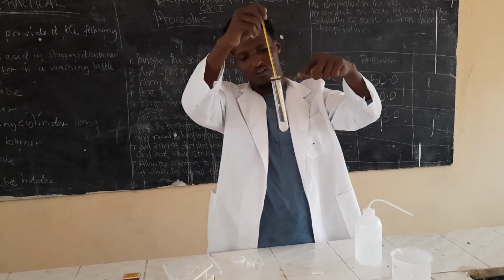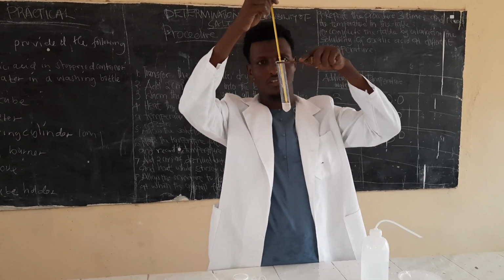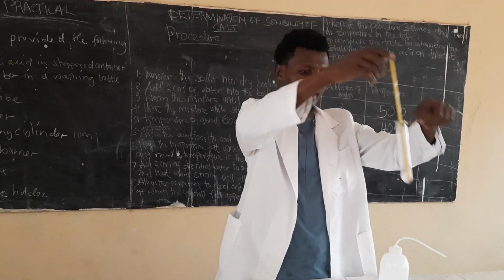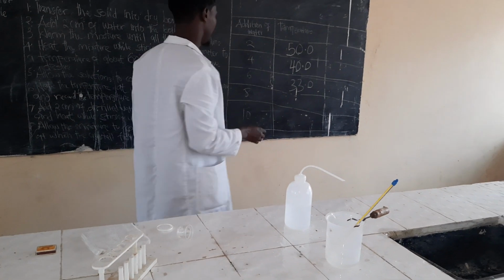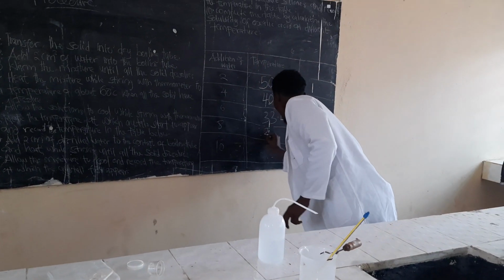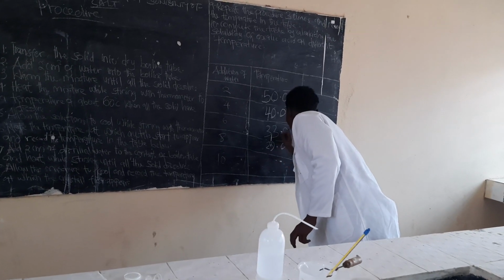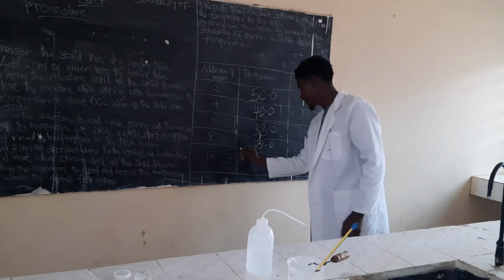So let's look at the temperature now. The solid formed at a temperature of 29.